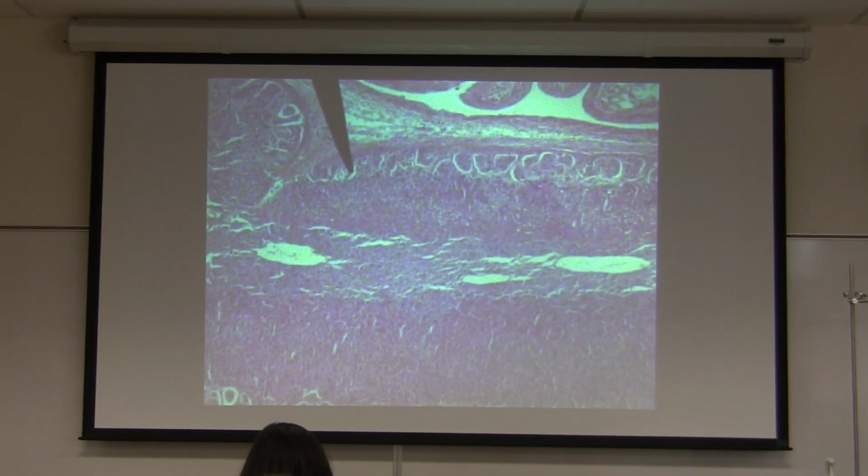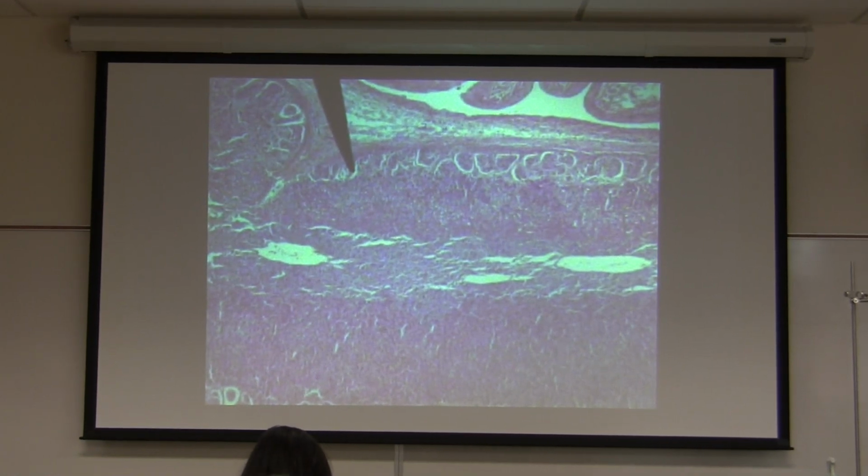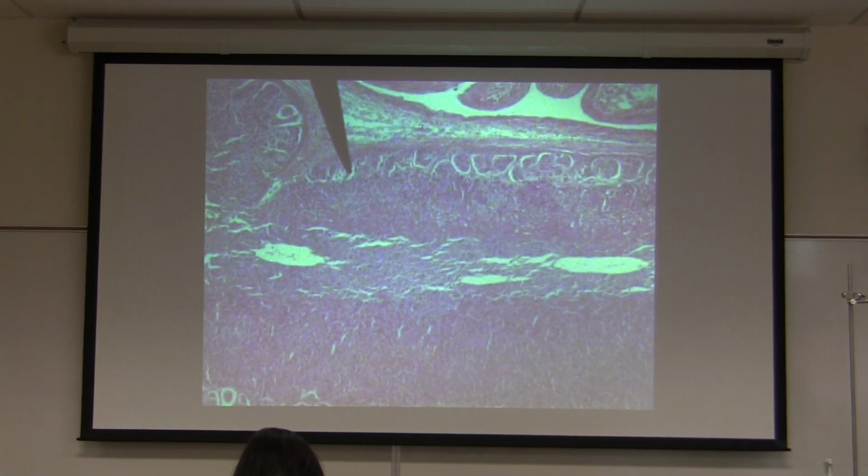Okay, it didn't turn green. Yeah, the red light is on? We're good. Red light is on. Okay, you guys are gonna like this part.